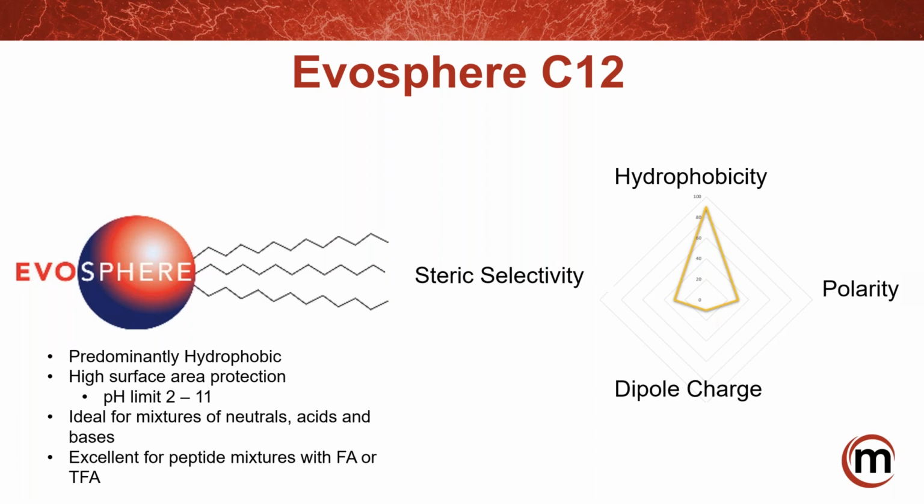So one, this C12, is interesting because you can actually bond more C12 onto a silica surface in some cases than C18. And so that coverage gives you some unique benefits, especially to minimize the silanol impact. So what we've seen in some applications is that this expands the pH range of the material because you're not able to attack that silanol bond at mid to high pH.